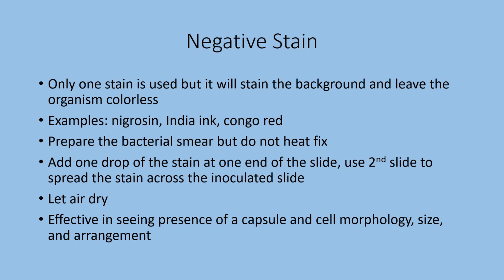One thing is, with a negative stain, oftentimes it is a little bit easier to see if the bacteria has a capsule surrounding it. Not all bacteria do, but those that do have a capsule, often if it's a pathogenic strain, are more virulent. And so you're going to want to be able to see that.